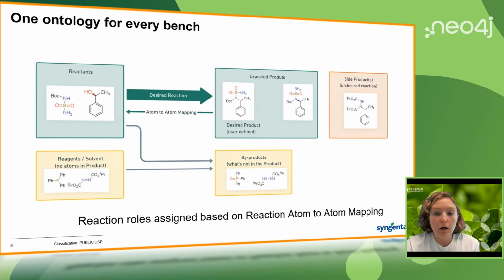It's essentially expected but unwanted molecules. And the side product is a surprise guest, which maybe comes from some remainings of the previous step of the reaction. So every bench, every entry goes through this ontology. And now what I showed you before, the ion of chlorine being the most connected intermediate, is killed by this ontology.